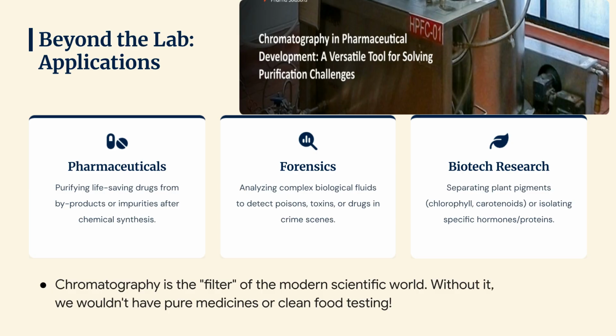Thus, chromatography is the filter of the modern scientific world. Without it, we wouldn't have pure medicines or clean food testing. Forensics uses it to analyze complex mixtures for poisons, and in research, we isolate and study pure vitamins from food, or pigments from plants, or even hormones of the body.